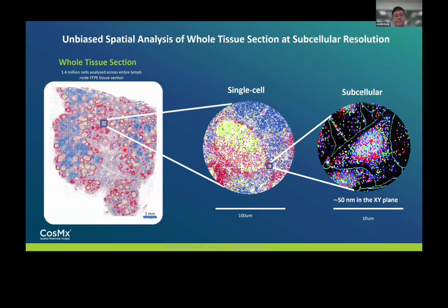on the tissue section. But other than that, on CosMx, it can go beyond, in which you can zoom down to single cell level and see, for this specific cell, what are the most abundantly expressed transcripts, genes or proteins, and where the relative expression locations are. So if you go down to the subcellular level, you can see whether the transcripts are expressed mainly in the nucleus, the cytoplasm, or in the ECM, extracellular matrix.